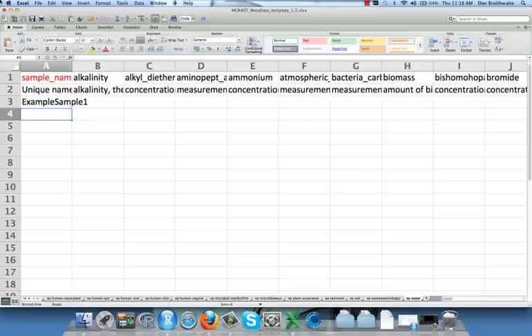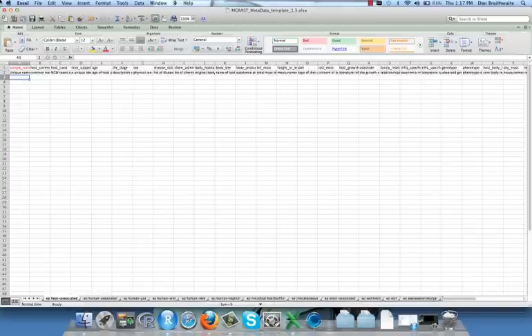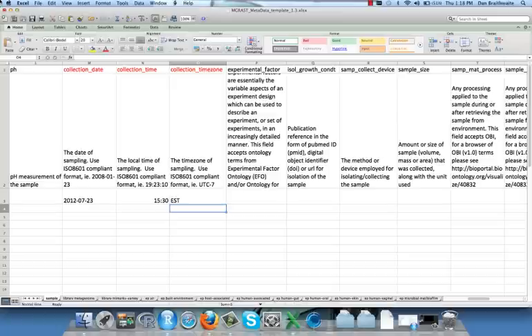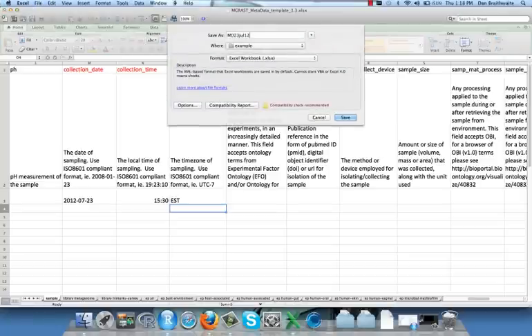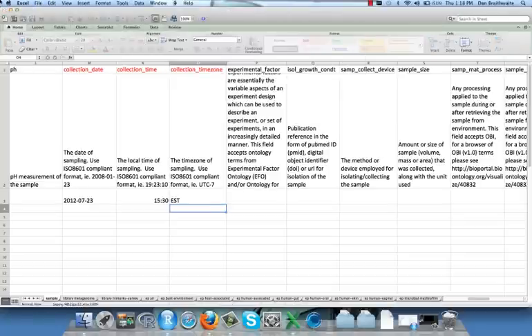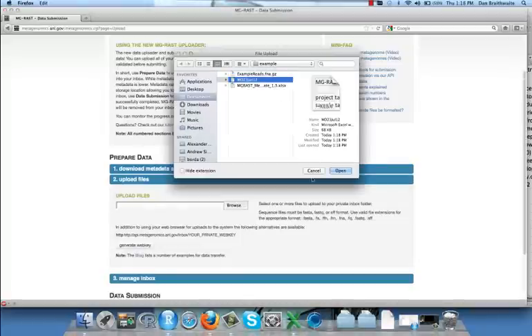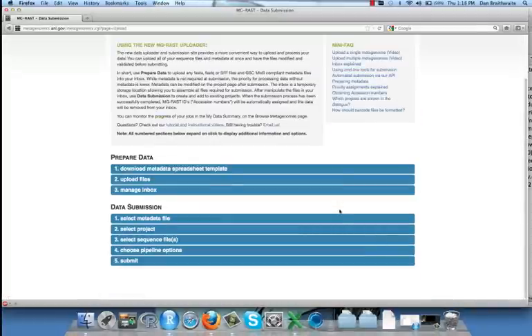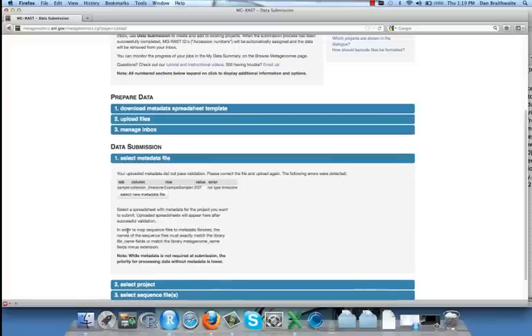The spreadsheet is now done, but for demonstration, we introduce a common mistake to show what happens when the validator fails. EST does not conform to the required time zone format, so this change will make the spreadsheet fail validation. Notice the following steps. We save the spreadsheet locally. We upload it to our inbox. We attempt to select it. But it does fail, and notice that the validator provides a detailed explanation.